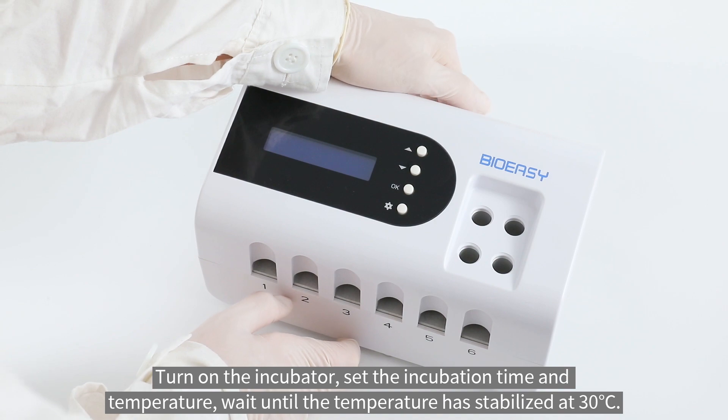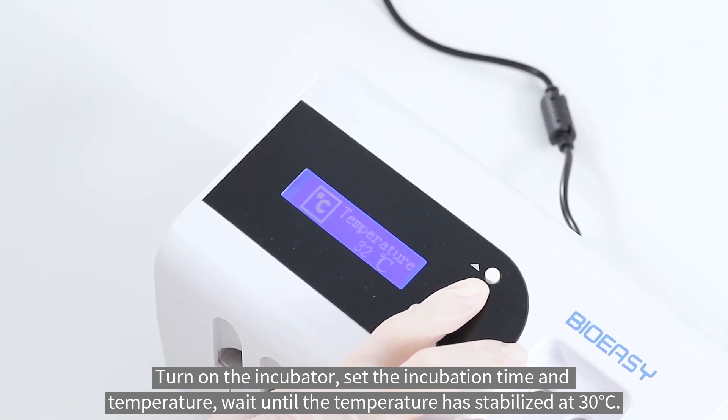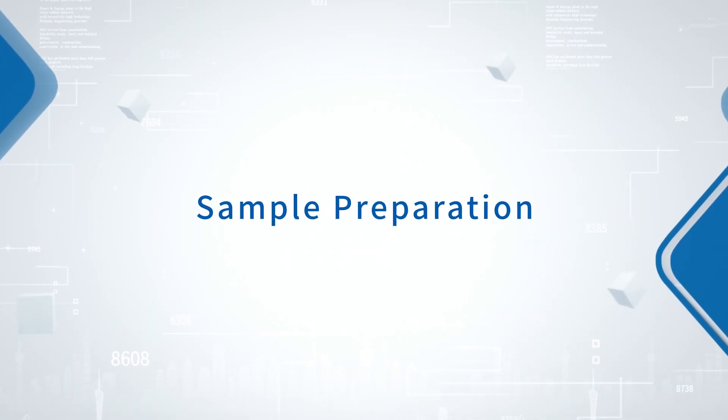Turn on the incubator, set the incubation time and temperature. Wait until the temperature has stabilized at 30 degrees Celsius. Sample preparation.